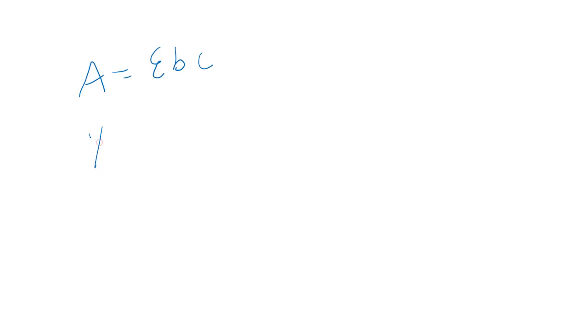and we're going to fit this to the equation of a line. And you're going to get this data from your LabQuest. So if you think back to algebra, the equation of a line is y equals mx plus b, where m is your slope and b is your y-intercept.